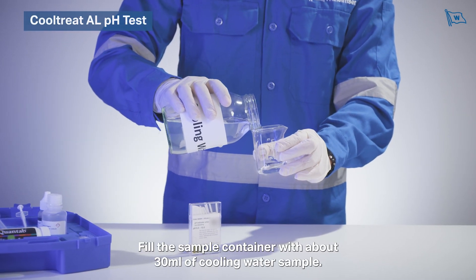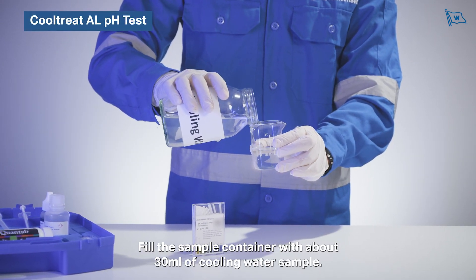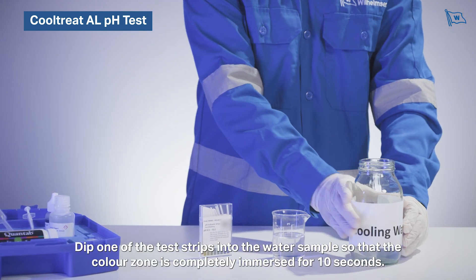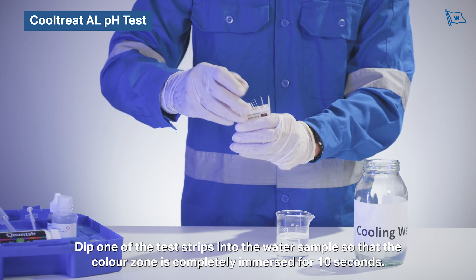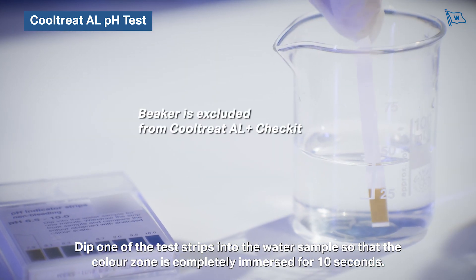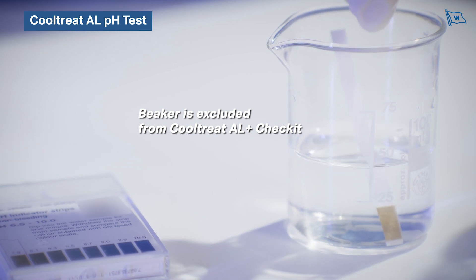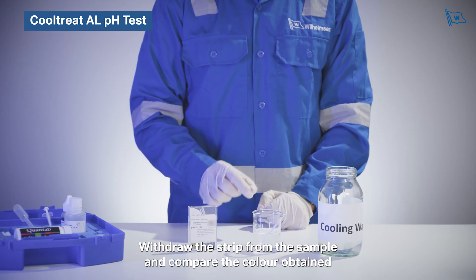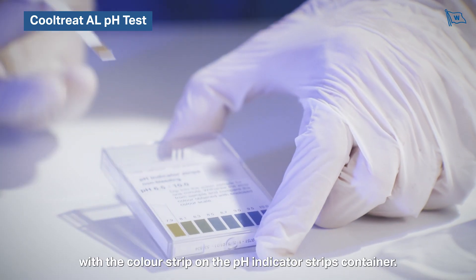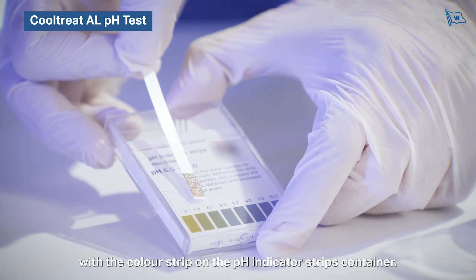Fill the sample container with about 30 millilitres of cooling water sample. Dip one of the test strips into the water sample so that the colour zone is completely immersed for 10 seconds. Withdraw the strip from the sample and compare the colour obtained with the colour chart on the pH indicator strips container.